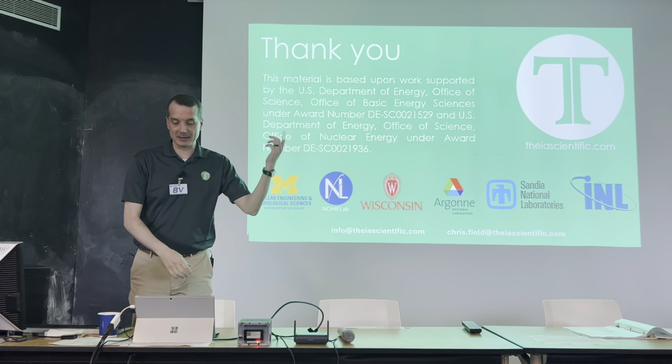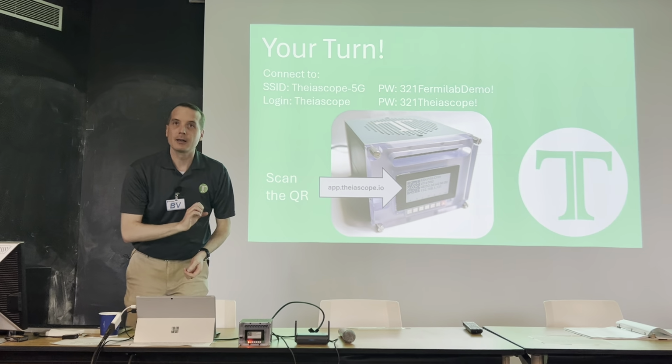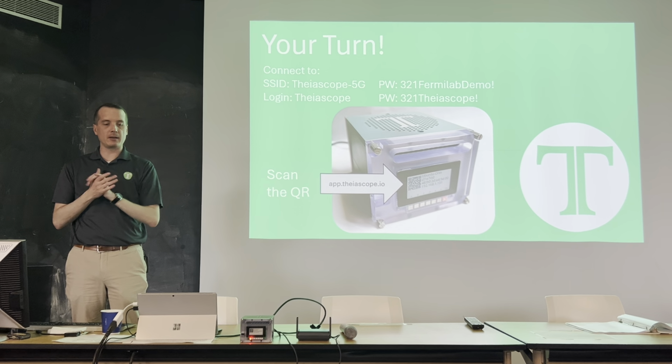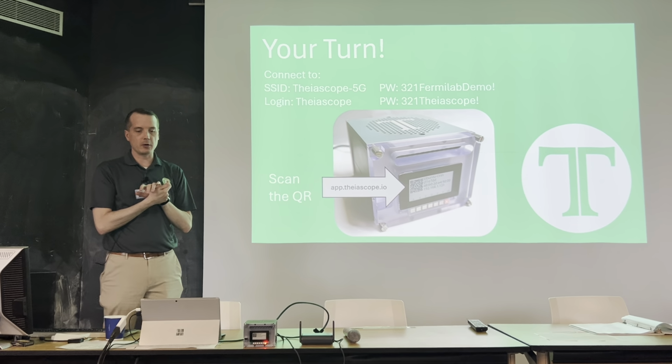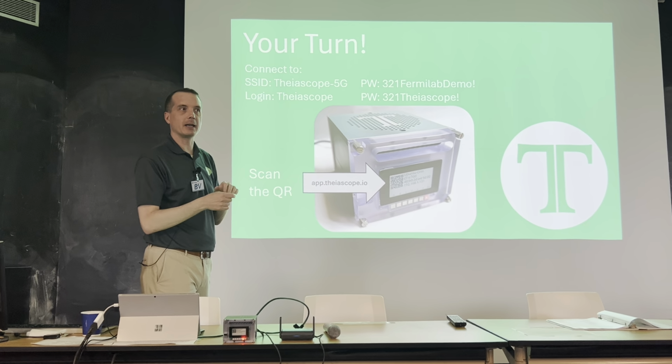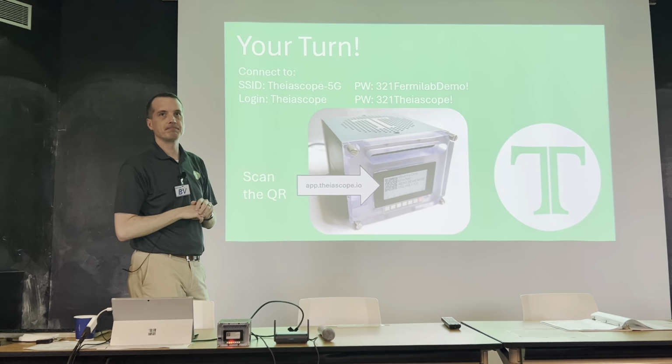And we have a little bit of time, or if you stick around, you can do this now too. We have it set up. If you look on your laptop, there's the Theiascope 5G or the Theiascope Wi-Fi connection. Here's the password. You can log in and give it a shot if you'd like.